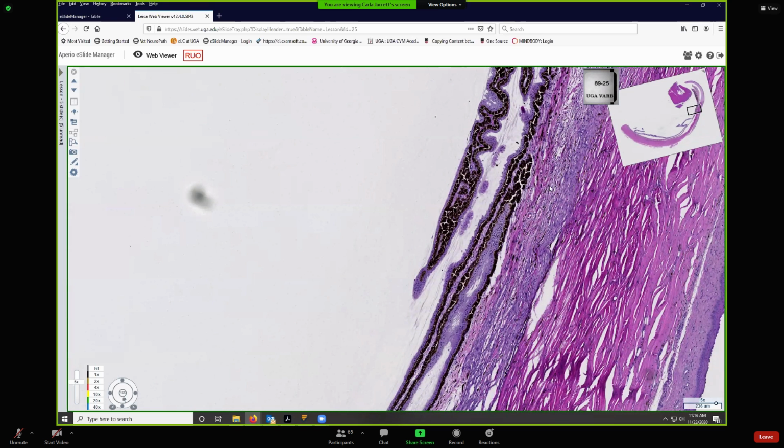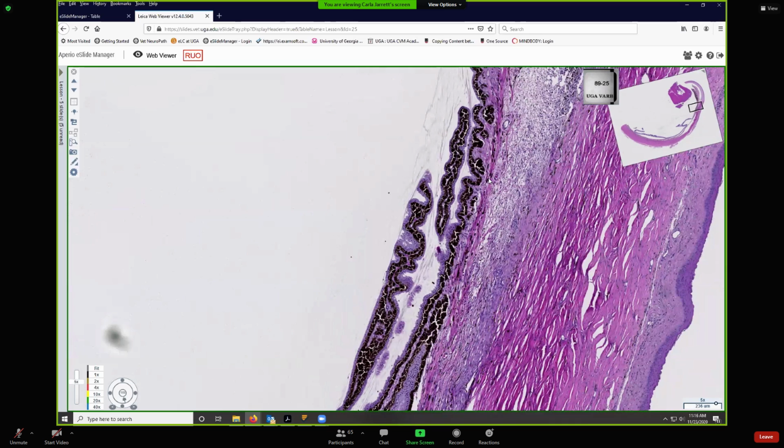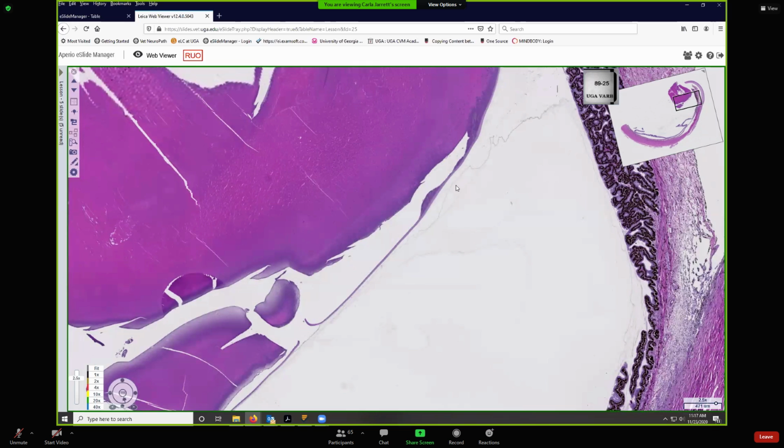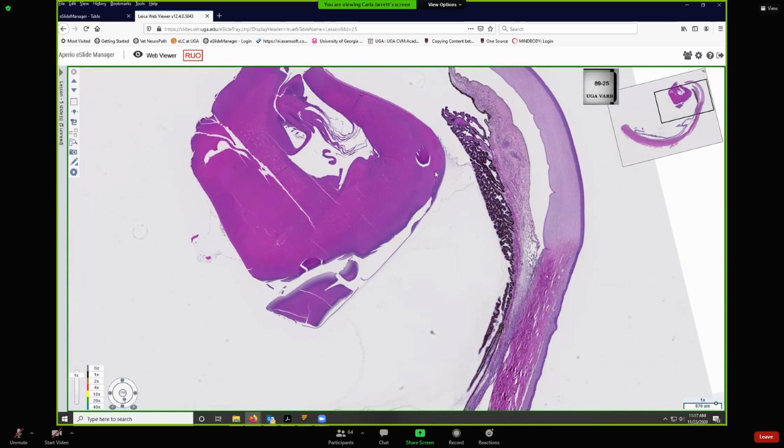It'll cause this connective tissue right here of the ciliary body to become mounded a little bit, to protrude in towards the posterior chamber. And that's going to happen all the way around the eye, 360 degrees. That's going to relax tension on these zonular fibers, and therefore we're not pulling as much on that lens capsule, and the lens is going to want to round up. Okay.